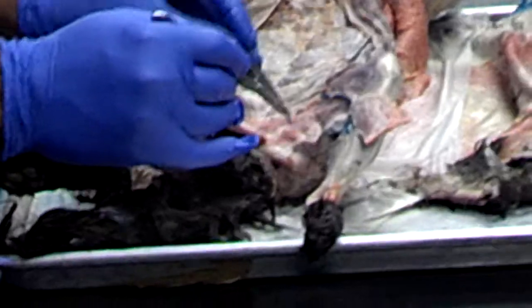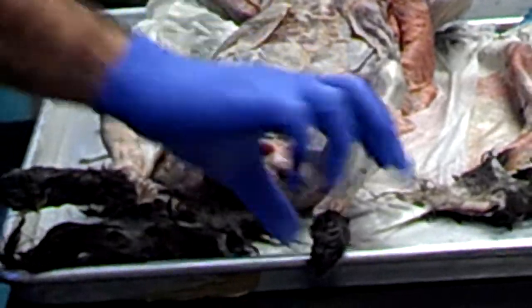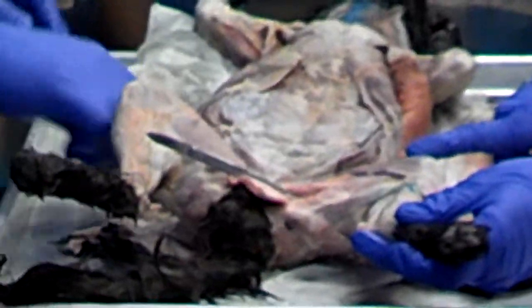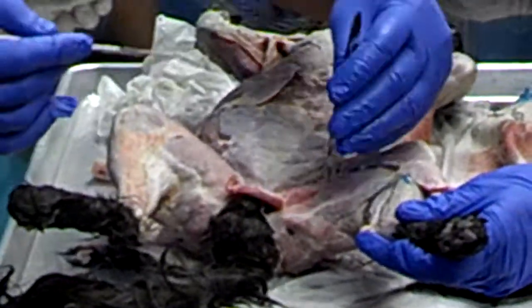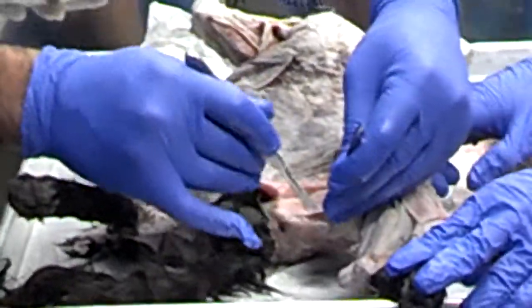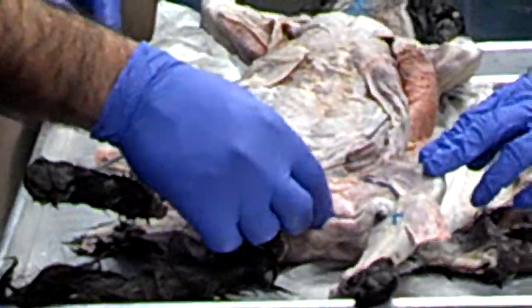Here, this muscle is your adductor femoris. Hold this here. This muscle is semimembranosus, and this is your semitendinosus. So you have to separate them right here. You can see the separation line here. I'm going to hold it and move like this. This is your semitendinosus. This is your semimembranosus.